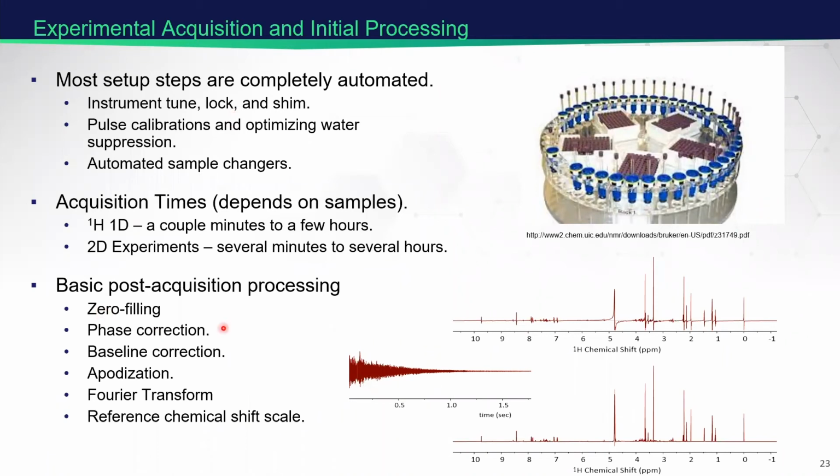Acquisition times, it really depends on your sample. If you have decent concentrations, it can only take a few minutes. But as you saw in that pore water sample that I showed earlier, the one before lyophilization, we might measure one of those for a couple hours. 2D experiments, you can count on them always taking longer than the corresponding 1D. But in decent samples, even a 2D experiment, especially homonuclear ones, can be quite fast. But then again, these can also extend to several hours or the better part of a day. Like I said, it always depends.